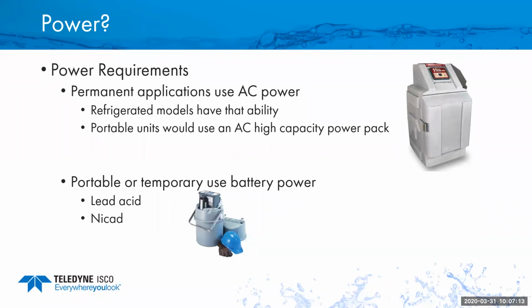Another question we get a lot of times is, can I store the battery on the charger, so it's ready to go? NiCads or lead acids probably should not be stored on the charger. You can overcharge them, and that can damage your batteries. If you have an automatic battery charger that does shut off when it reaches full charge, then that's okay. But if you don't have an automatic charger, then 24 hours is probably the max time I would ever want to leave a lead acid or a NiCad on the battery charger.